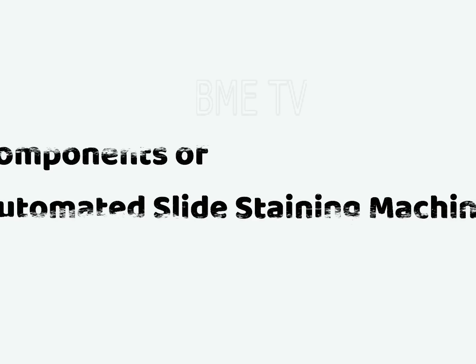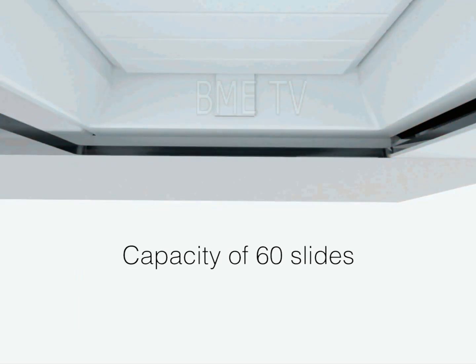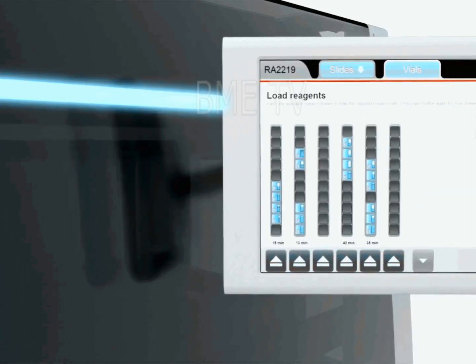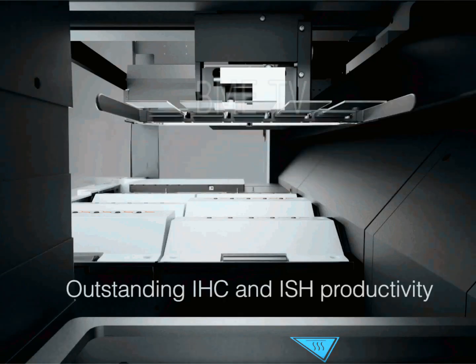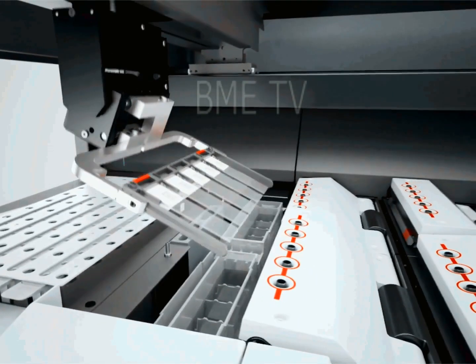Components of auto-staining machines. The first robotic IHC workstation, introduced in the 1980s by Brigati, achieved the complex steps of reagent application and washing using a capillary action technique between paired glass slides. In the following decades, machines have been developed to manage slide labeling, baking, deparaffinization, antigen retrieval, staining, cover slipping, and digital image analysis. Before we move to different components, let's understand the open and closed system.